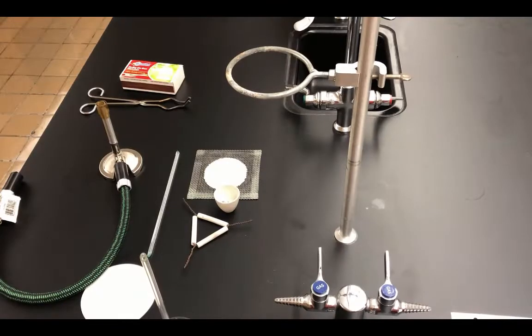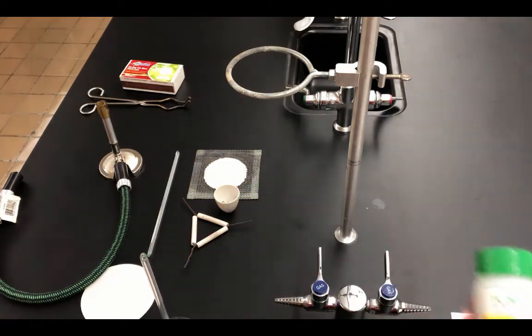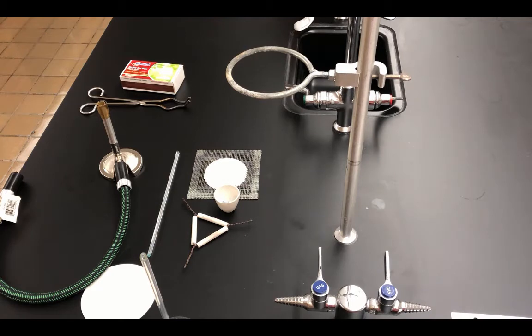The purpose of this gravimetric analysis lab is to determine the identity of a group 1 metal carbonate. In this lab, we have two unknowns, unknown 1 and unknown 2. One of these unknowns is potassium carbonate and the other is sodium carbonate. The purpose of this lab is to figure out whether the unknown that we work with is potassium carbonate or sodium carbonate. To determine the unknown, we're going to use a process called gravimetric analysis.